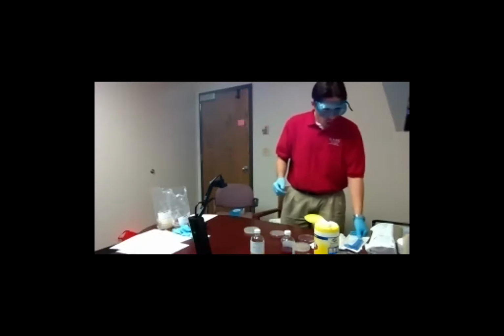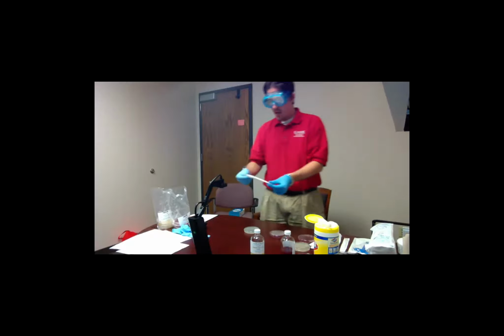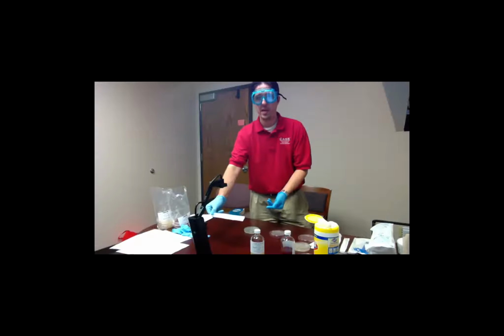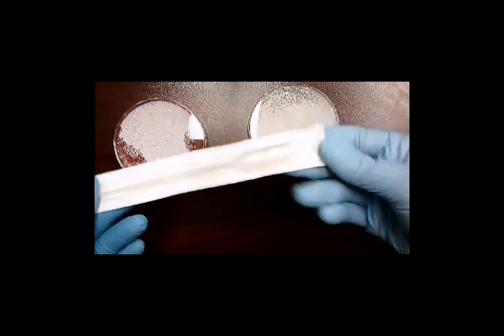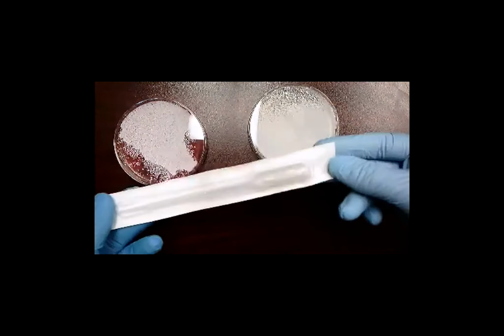So what you have to do first is the kit comes with micropipetters. There you go. So the kit comes with micropipetters that are sterile and they're sealed in plastic.